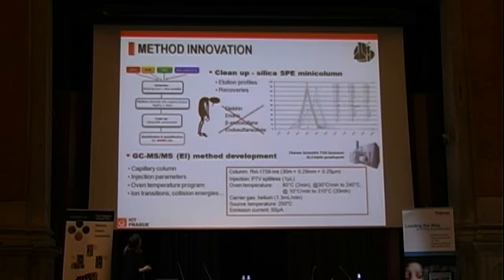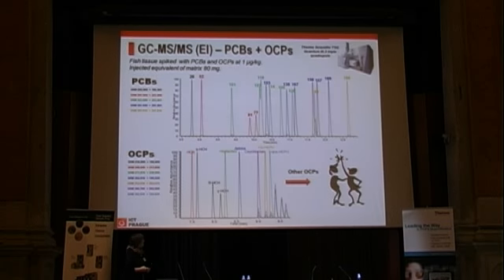This project is still ongoing, so I cannot draw conclusions for incurred samples, and incurred samples are an issue related to sample prep, not to the instrument. So you can see the MS performance here for PCBs and for some organochlorine compounds, with good outcome. Then we still have some tasks in front of us. From this big list, some compounds need more care. And as those who work with brominated compounds understand, BDE 209 and these very heavy species need improved chromatography to make it shorter, and some special approach.